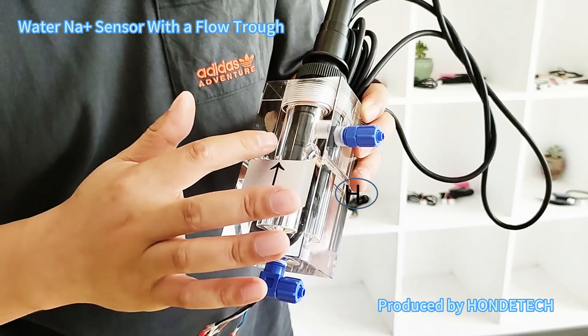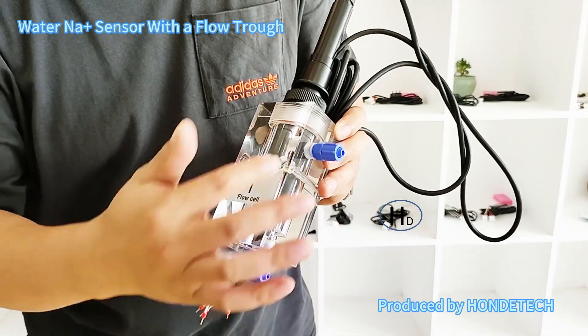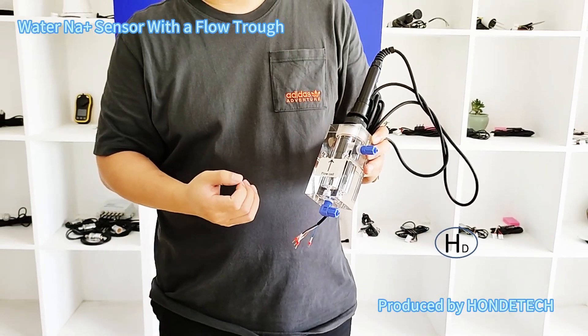And secondly, the air bubbles can be released by this device, so it can provide a very high accuracy measurement environment.